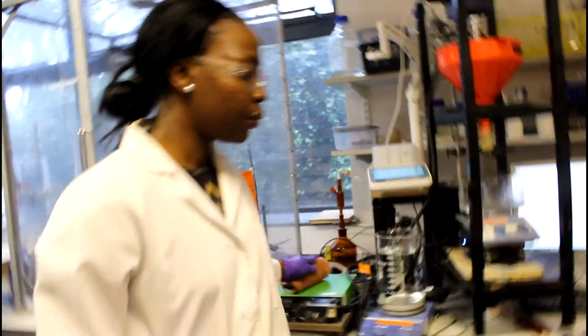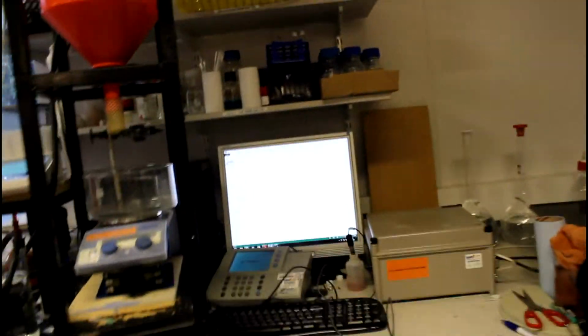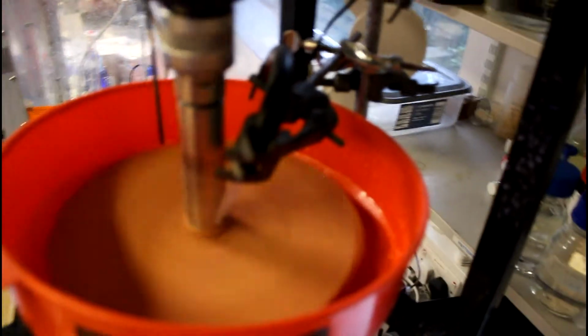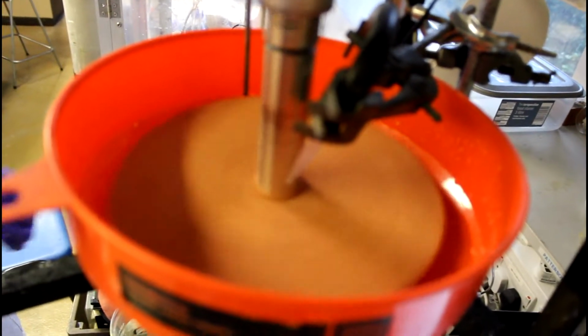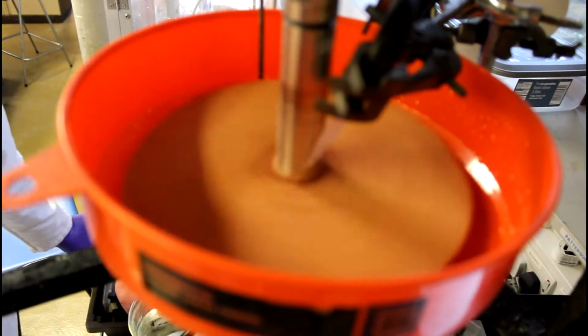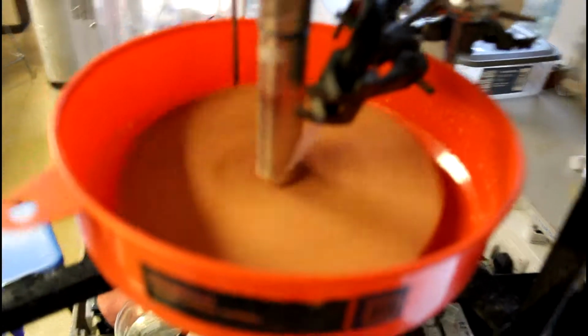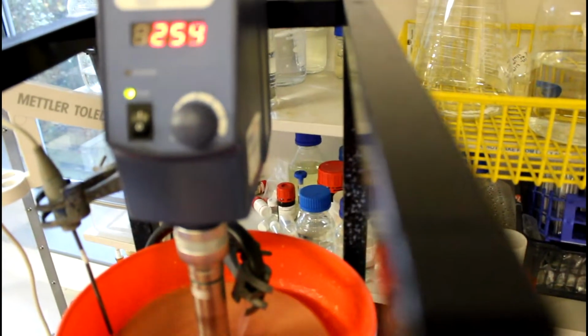So in order to start the experiment, right now the nylon blanket has been placed in the reactor and the probe is right next to the disc. We'll start the reactor, and the flow rate has been set to 5 mL per second and the spinning disc is also set to 254 RPM.